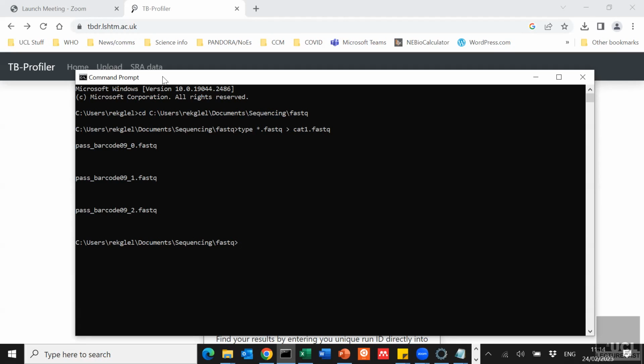Right, so how far have you managed to get? Right, so it's now zero in time.